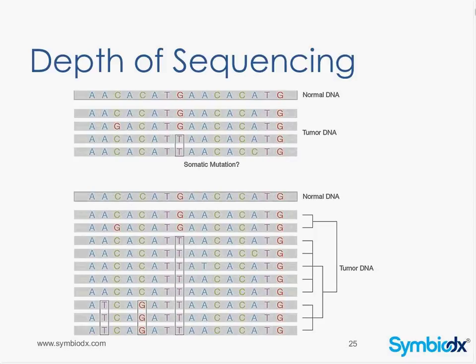You can also see this little G over here, and you can wonder if that's also real. It could be a somatic mutation, right? In this sampling here, it's 25%. There, where we have slightly more depth of sequencing, we can see that the T here is definitely real. This winds up being about 80% of our DNA, and this could be your tumor content. If you have 80% tumor content, this is 100% of your tumor DNA. So down here where we have more depth, we can tell that this T is definitely real. We're also picking up a G over here and a T over here, and it turns out that the single G over here is probably a fluke, because we just saw it once.